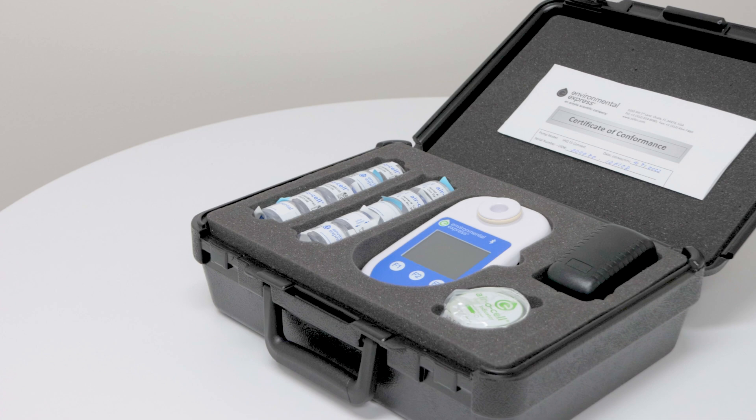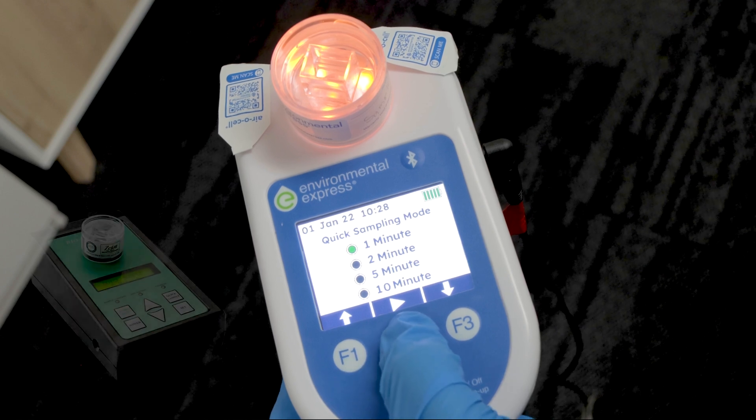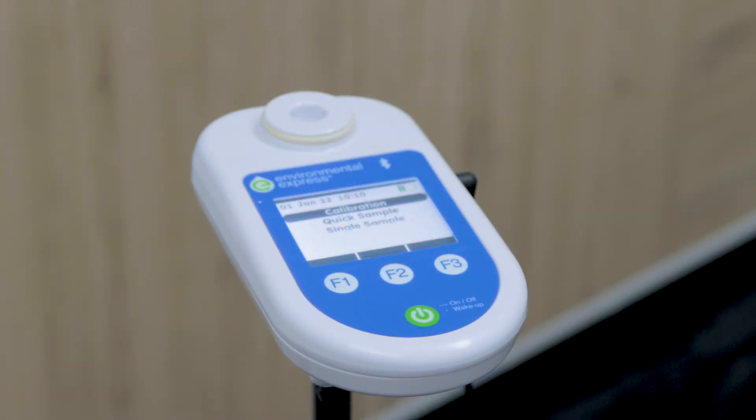Hi, I'm Glad from Agile Equipment and iQ Direct, here to show you the iQ15 Connect by Environmental Express. The iQ15 is the long-awaited follow-up to the popular Zefon Biopump, featuring a new compact design, colour screen, and long-lasting battery, making it the perfect mold sampling pump.